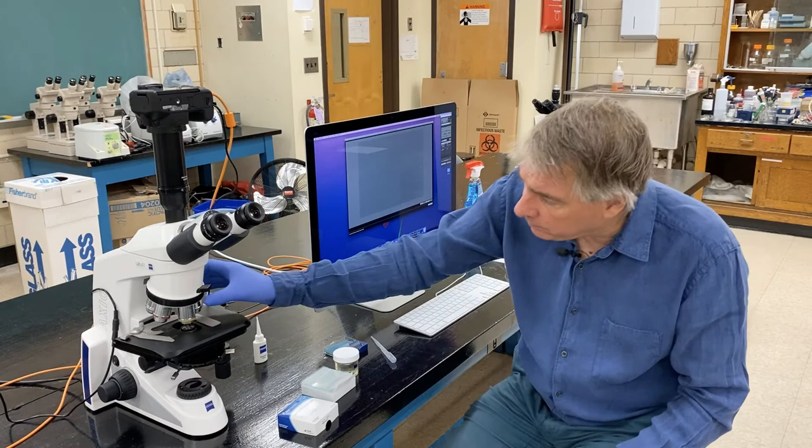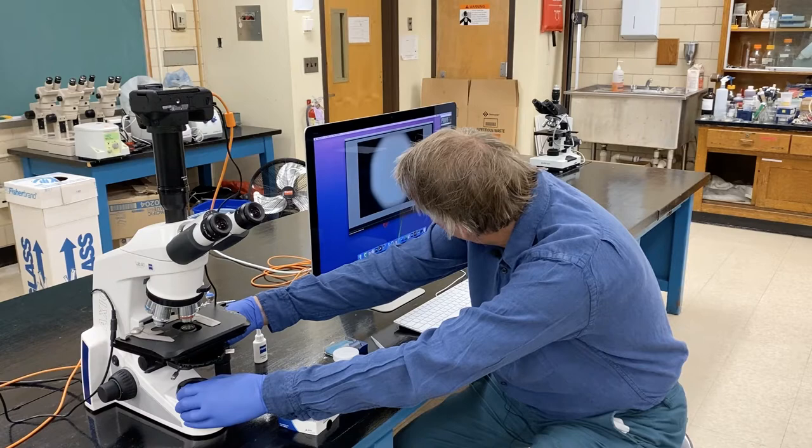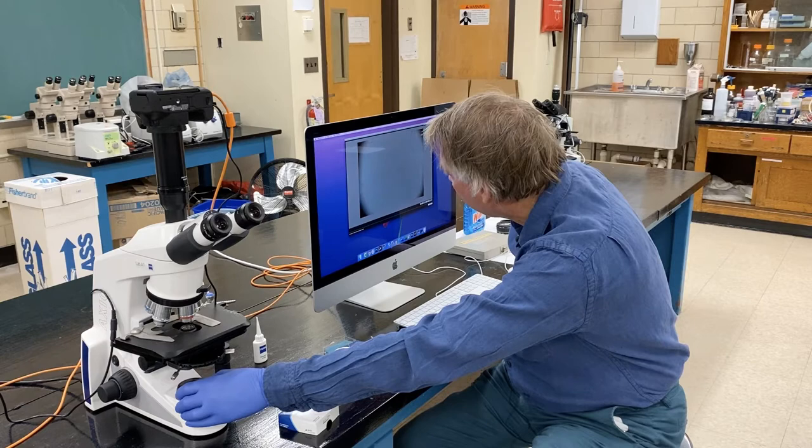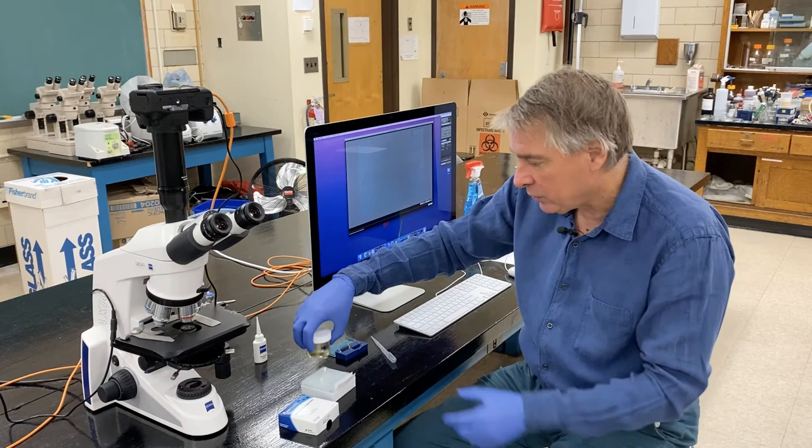And I'm gonna turn this down to the 5x objective and open up. I'm gonna focus the field diaphragm. That's as good as it gets for the 5x objective, but 5x isn't affected very much by Köhler illumination, so that's fine. I'm going to open up this diaphragm, and I'm going to make a slide with our first sample, which is Stentor, which is one of my favorite critters to look at.